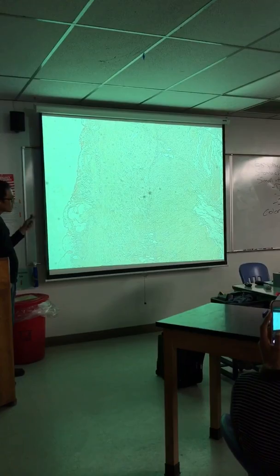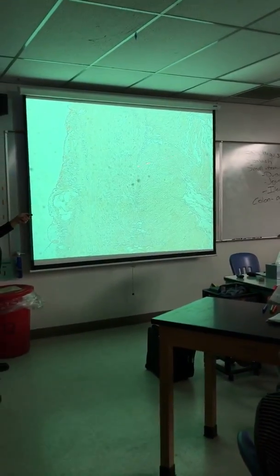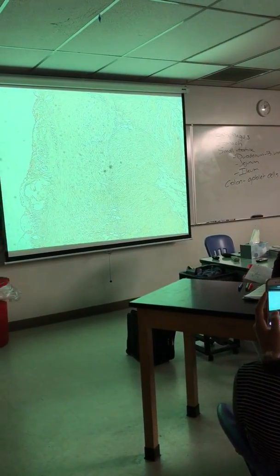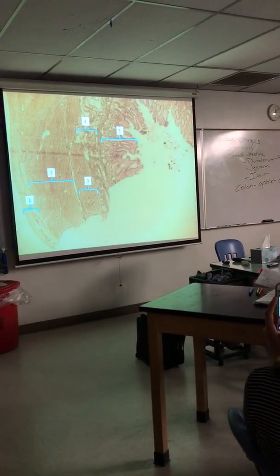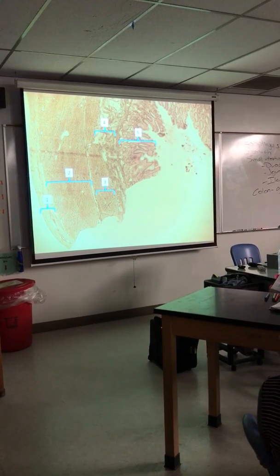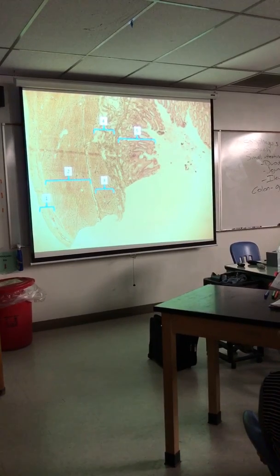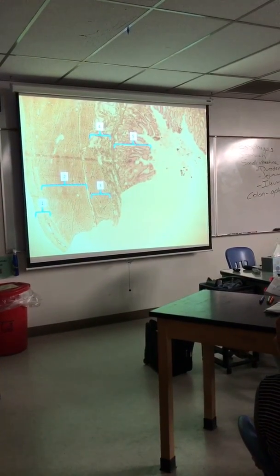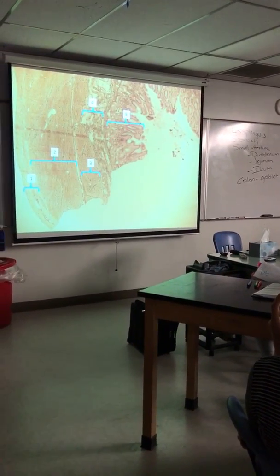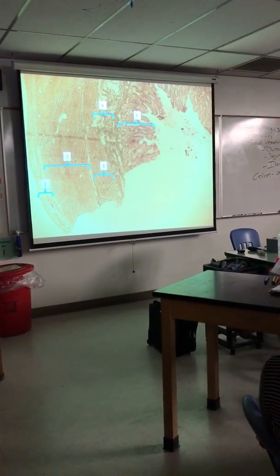It's not very clear. This is supposed to show you 3 muscle layers in the stomach. The inner oblique, circular, and then this one's longitudinal. Although the quality is not so good. This one's better. Here we see 3 layers of muscularis externa, the longitudinal, circular, and oblique. There's a little break there to make it easier for me to figure it out. Number 4, submucosa. Number 5, mucosa. You can see the pits on the surface there, and the glands deeper inside.